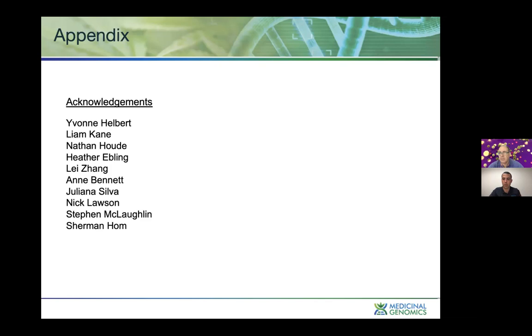All right, and one more came in, and I'm going to sneak it in here. Have you heard of any interference between rapid 3M yeast and mold plates and certain cannabis products, such as seeds or nut butters? Oh, that's a good question. I have not heard anything directly on those.